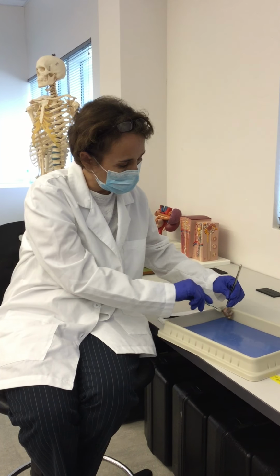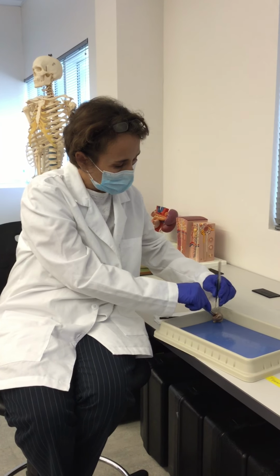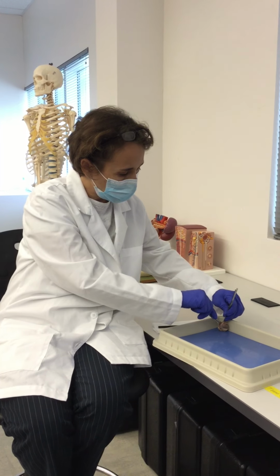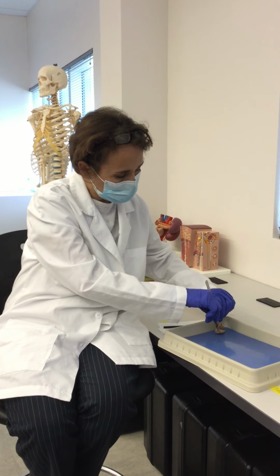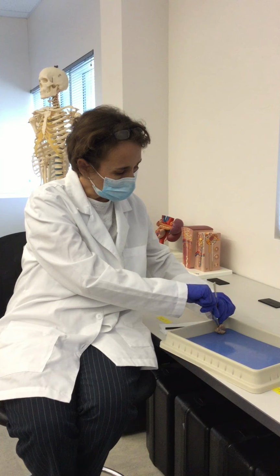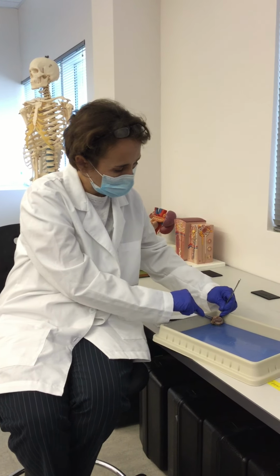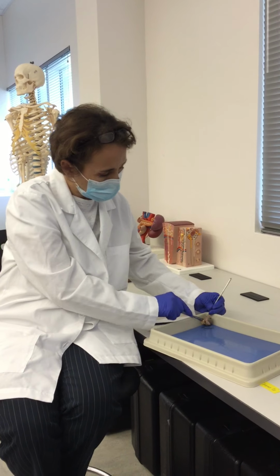That's the part that fell out from the eye when I was doing this section. And then in the anterior cavity, we have a fluid that is a little bit less dense, that is called the aqueous humor. So I'm going to continue my section towards the entire circumference of the eyeball, so we can see the internal structures. I'm going to keep holding it against the corner of the tray while I'm doing the section.